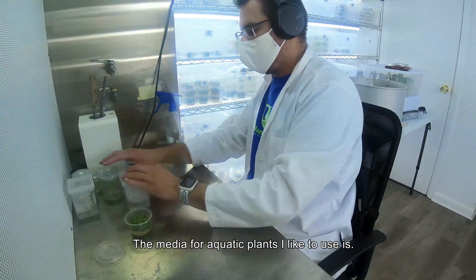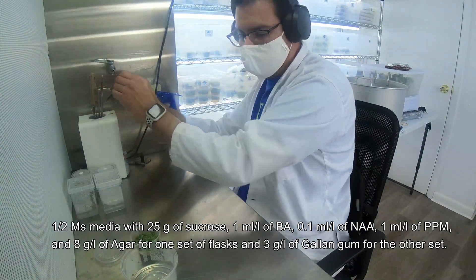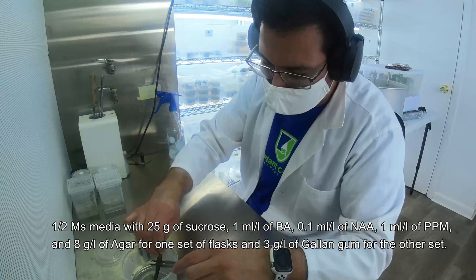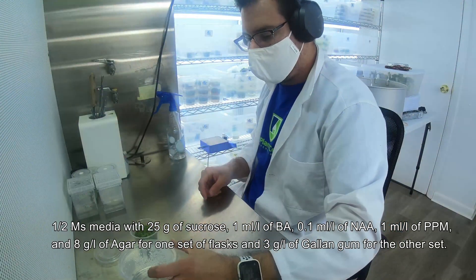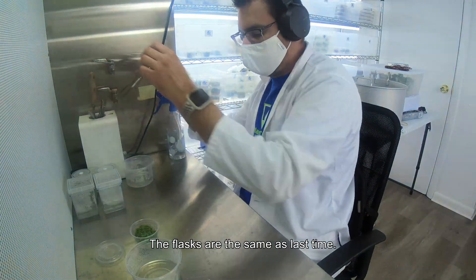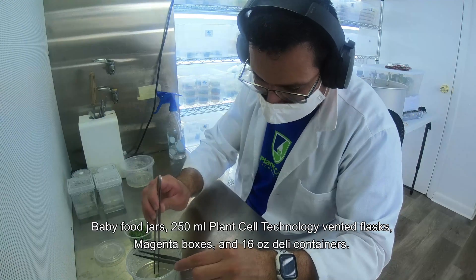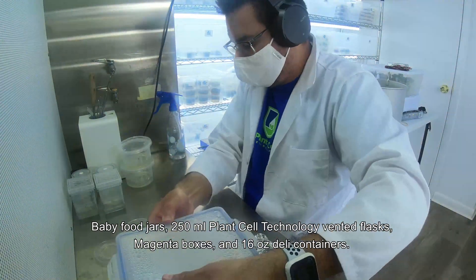The media I like to use for aquatic plants is half MS media with 25 grams of sucrose, 1 ml per liter of BA, 0.1 ml per liter of NAA, 1 ml per liter of PPM, and 8 grams of agar for one set of flasks and 3 grams of gellan gum for the other set. The flasks are the same as last time: baby food jars, 250 ml Plant Cell Technology vented flasks, Magenta boxes, and 16 ounce deli containers.